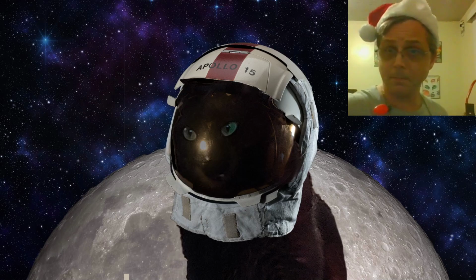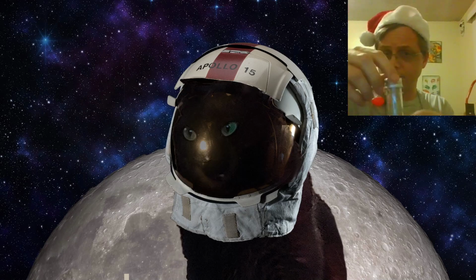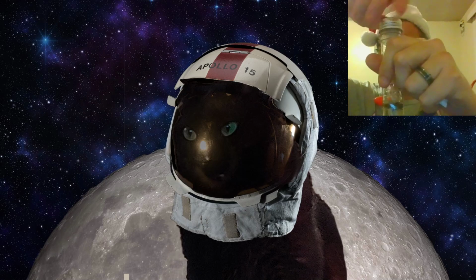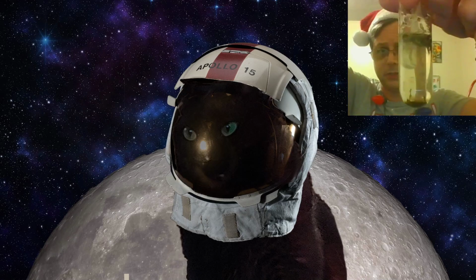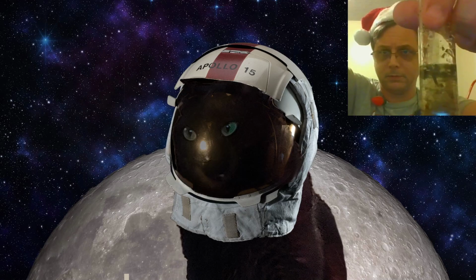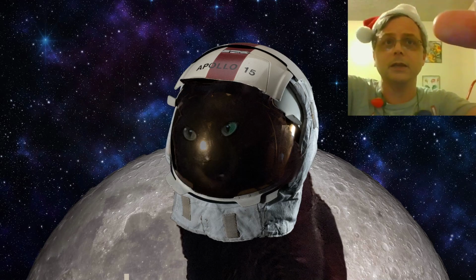Alright. Might as well try it one more time. Something off the bottom again. Or, yeah, I think I got the best results by stirring it up, blowing air into it, like so. And just getting whatever I can get.